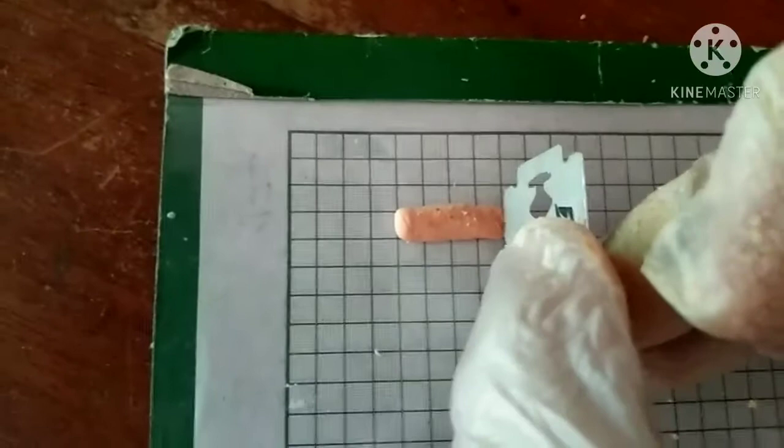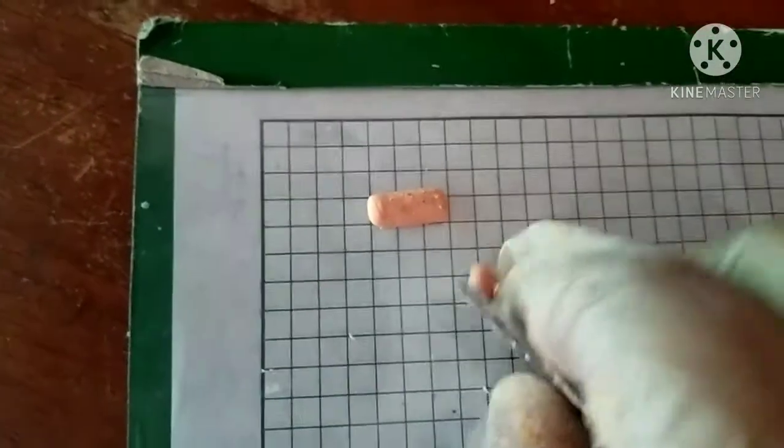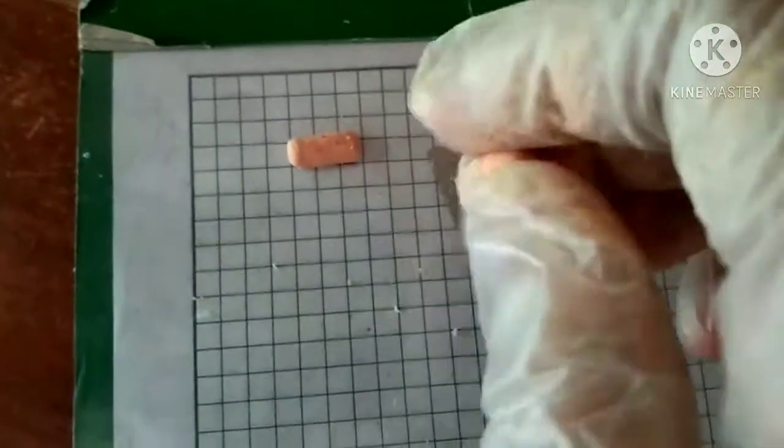Using the hand rolling technique, get the first portion of the mass and mold it into a peel. Hand roll all four peels.